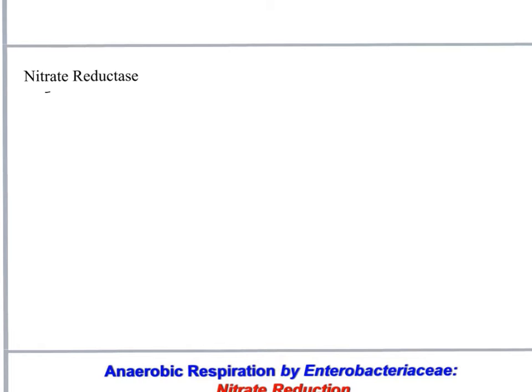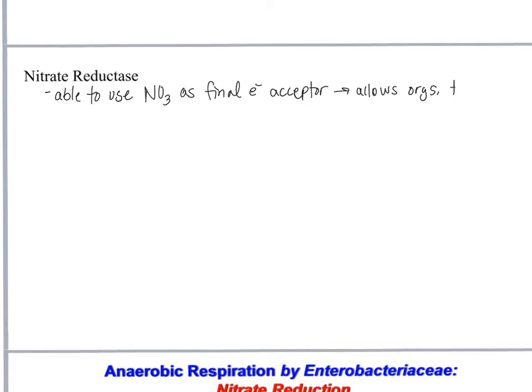Organisms that are positive for this enzyme are able to use nitrate as a final electron acceptor instead of oxygen. Okay, so the so what of that is that allows organisms to respire anaerobically.